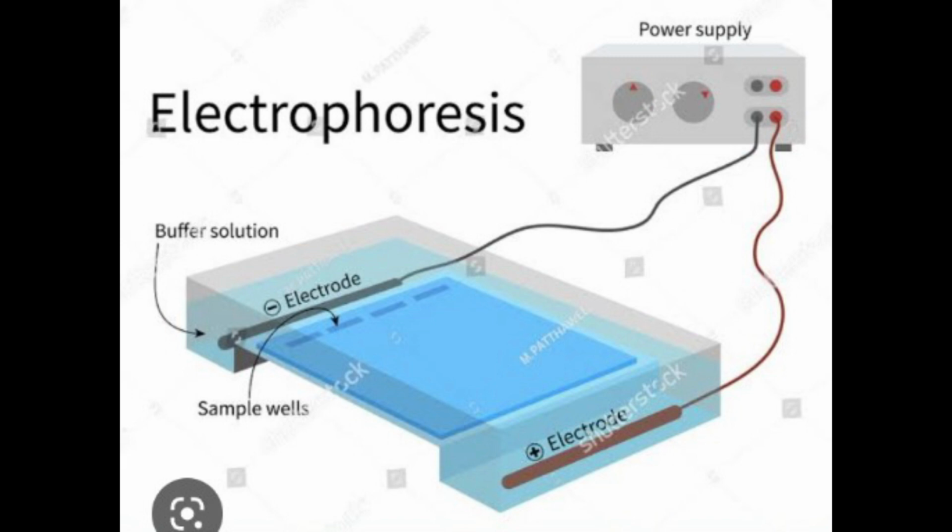So it is obvious that molecules having similar charges move in the same direction, but there is a difference in movement due to their different molecular weight. Therefore, the difference in charge to mass ratio forms the basis for differential migration of particles in an applied electric field. This forms the general principle of electrophoresis. Forces acting in an electrophoresis system: the force of the electric field, which is the impelling force, and frictional forces and the electrostatic forces of attraction between the sample component and the supporting media, which are the retarding forces.